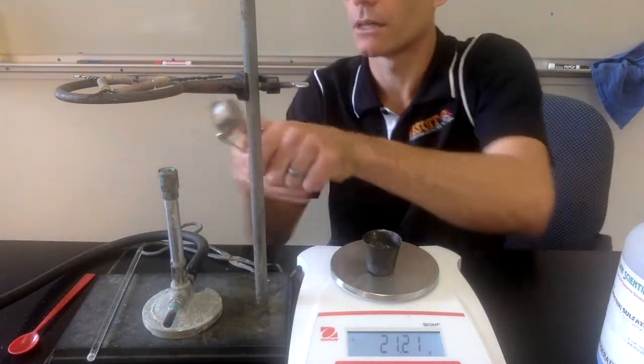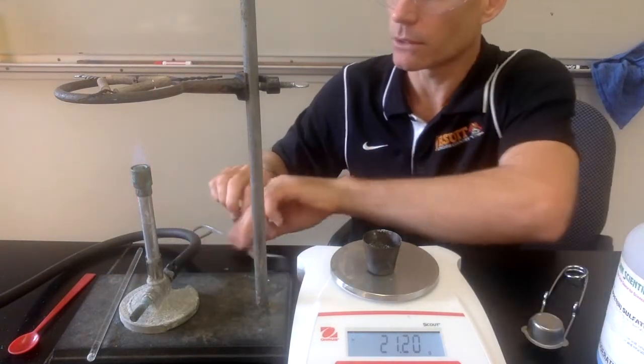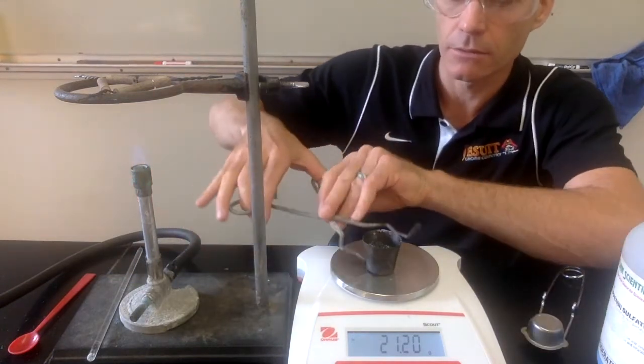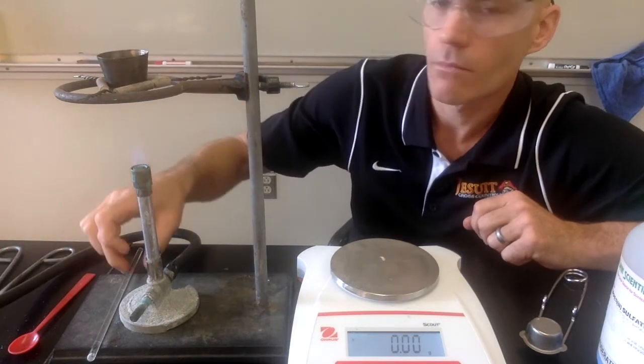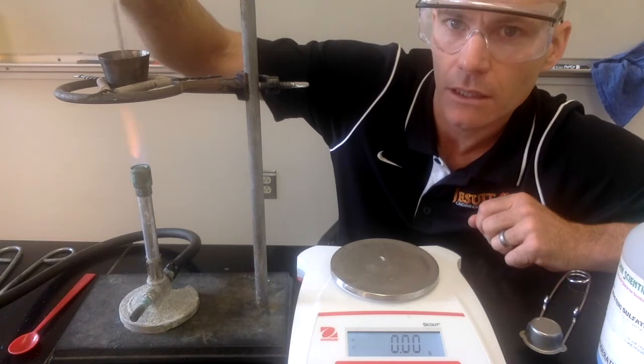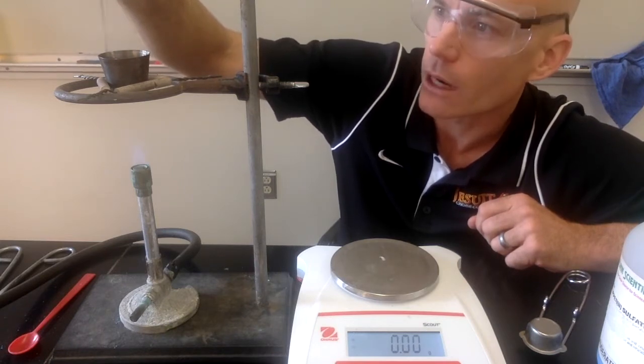I'll relight my Bunsen burner and set the crucible back up on the ring stand. We'll heat it and stir it one more time, then let it cool and weigh it one more time just to confirm that we got all the water out.